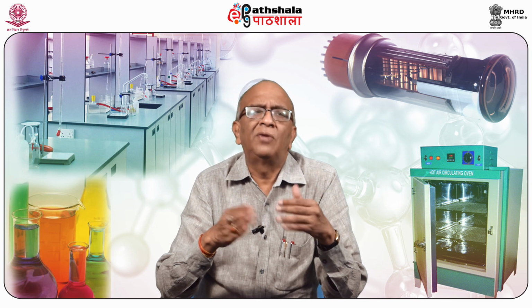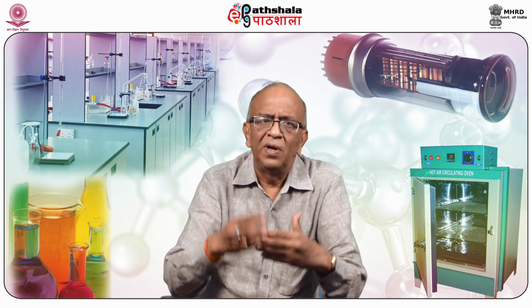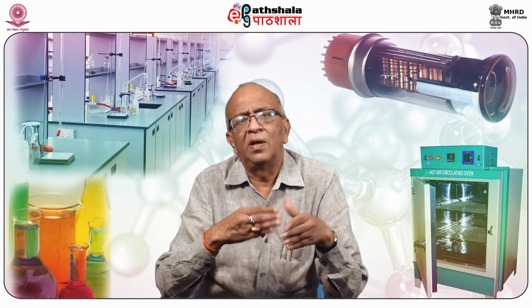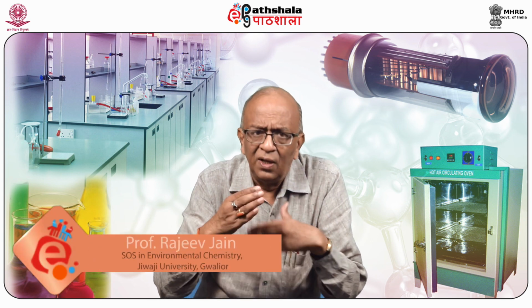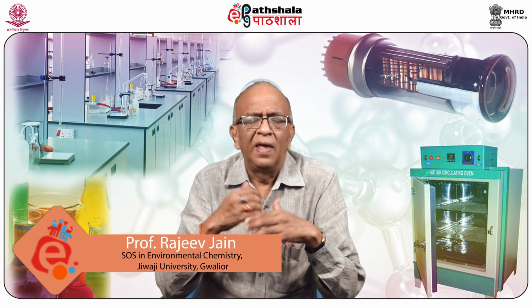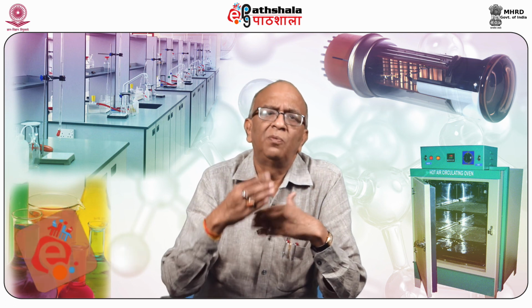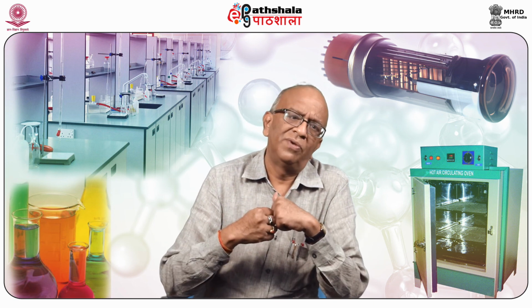So it is a separation technique as well as a technique for identification of unknown substances. By using thin layer chromatography, we can also quantitatively obtain the substances from a mixture, and it is the ultra pure substance which we obtain after separation from thin layer chromatography. Thank you.